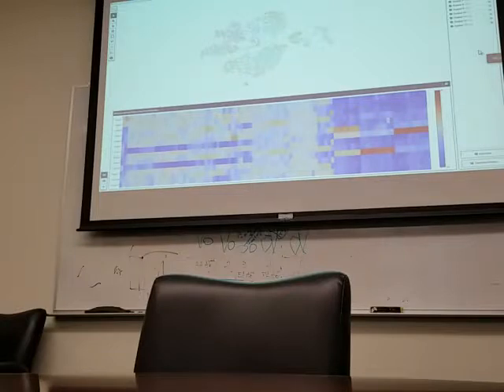This is 5 prime, right? This is the 5 prime. But Chris was saying, see that heat map? You just drag it out, and you get that. And he says then you can export with that little arrow. Well, actually, the arrow's not there. That's because this is not the table view. You have to go back to the table view, which is the one right in the lower left.